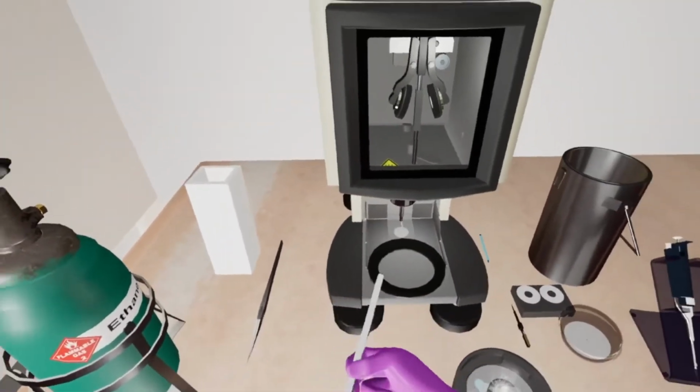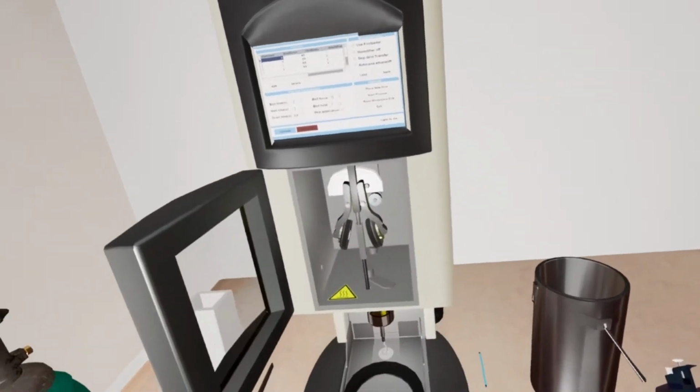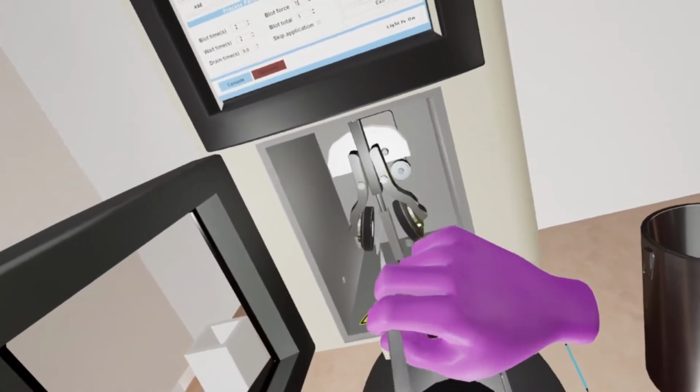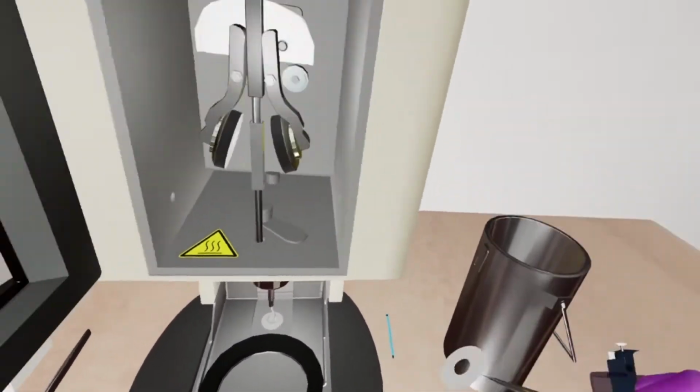Attach blot papers to blotting pads. Note that in reality you need to advance through the freezing cycle one time without tweezers to home blotting pads. This is essential for consistency.